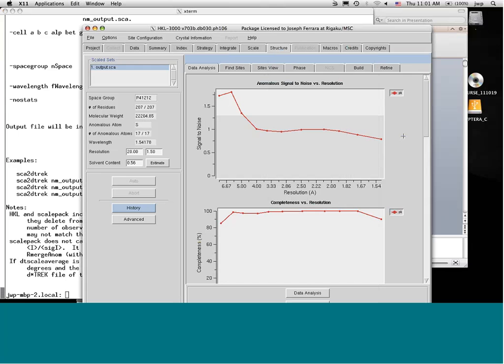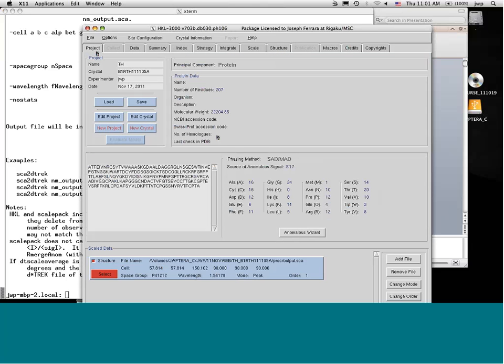The thing is, you're going to end up taking the data that you have. And most of these things were high resolution, but if you have selenium and so on, you're going to still be able to do some of this work.